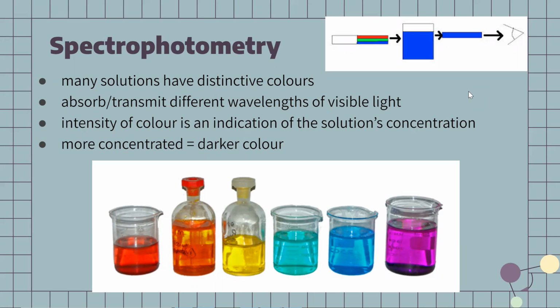The intensity of the color of the solution is indicative of that solution's concentration, which kind of makes sense, right? If a solution is more concentrated, it's going to be a darker solution. If it is less concentrated, it's going to be a lighter solution.